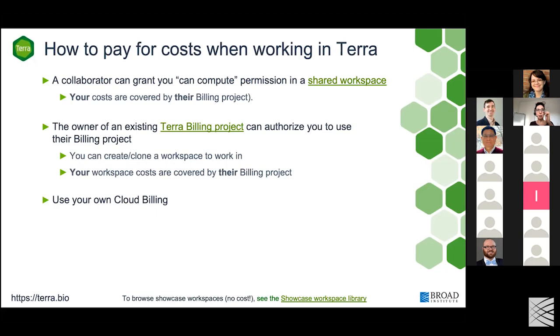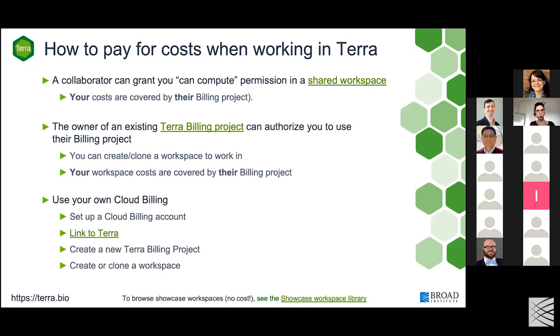And then the next piece is you can use your own cloud billing. You would set up a cloud billing account, link it to Terra, and you can use the linked account to create your own Terra billing project and create or clone a workspace.